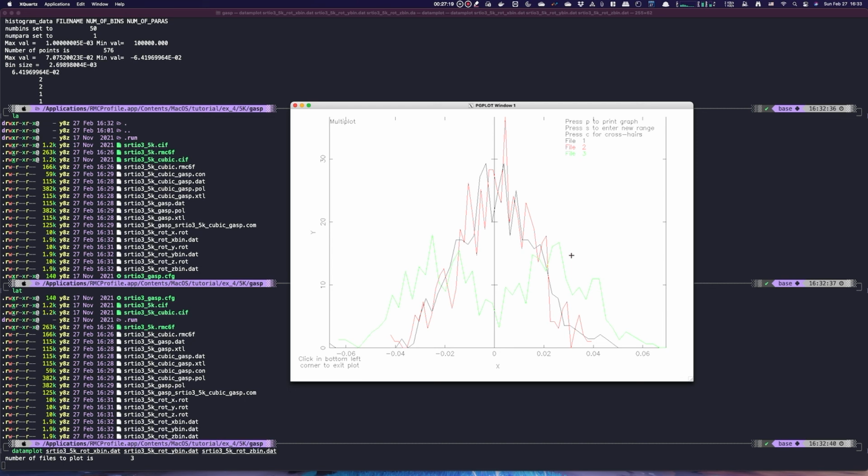So I think that's pretty much all for this exercise 4. It's a little bit lengthy, but I hope it's making sense to you all.